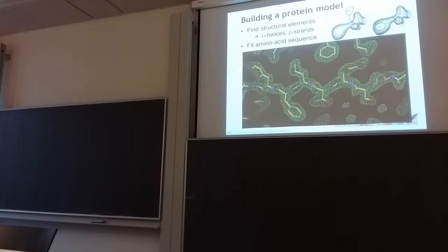There are examples where a protein was actually threaded in reverse through the density. This is called threading. There's a different kind of threading that Sanna will talk about when comparing structures and homology searching, but this is also threading, where you try to put your sequence into the density as well as possible. There's an example of a PDB structure, long since withdrawn, about 30 years ago, that was threaded in reverse through the densities.